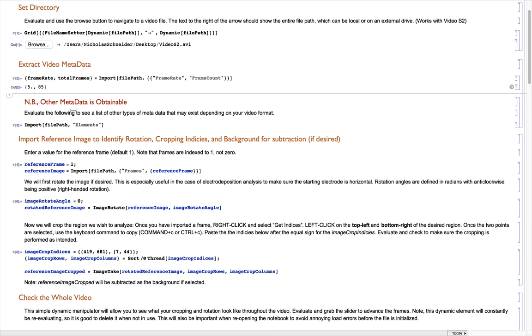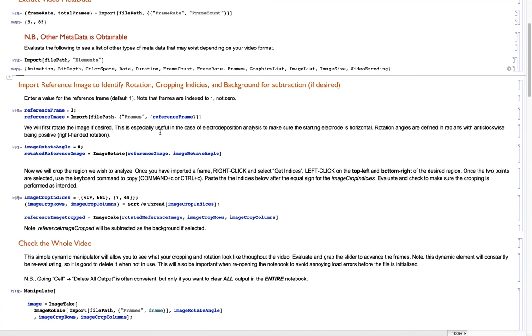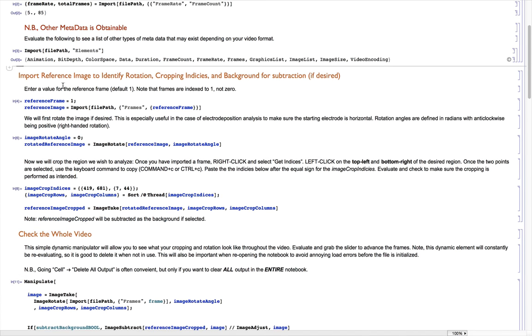If you want to know what other metadata options there are, you can use this line of import, the file path, and elements. This will return a list of all the different elements that you can get for the options of the metadata, so that you can better understand the video file.